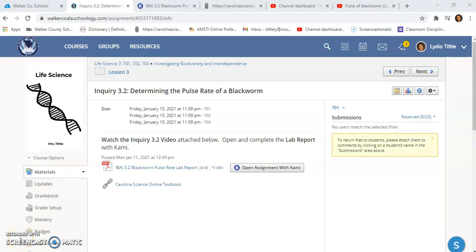Good morning, students. This is Ms. Tittle, and today we're going to be doing Inquiry 3.2. We're going to be determining the pulse rate of a blackworm.